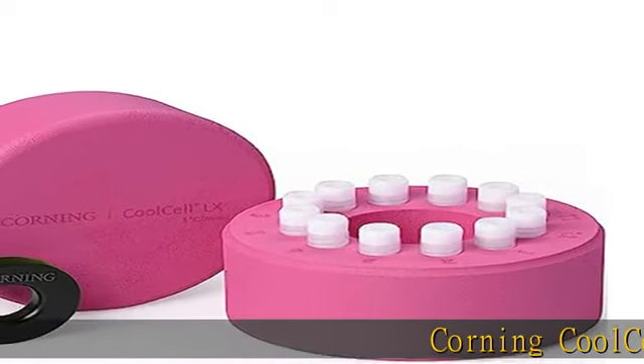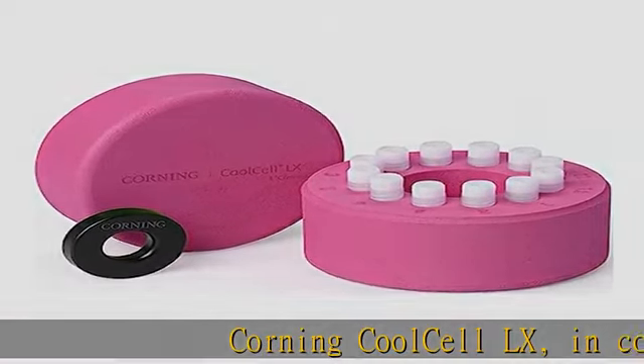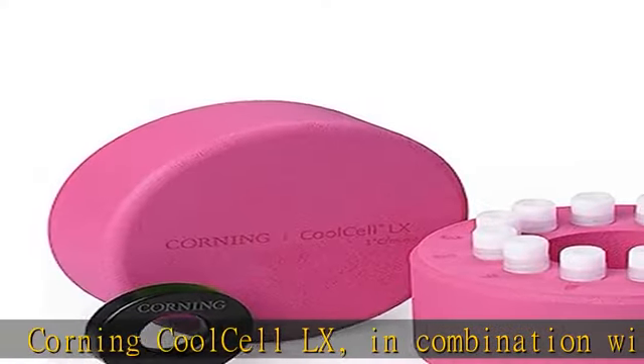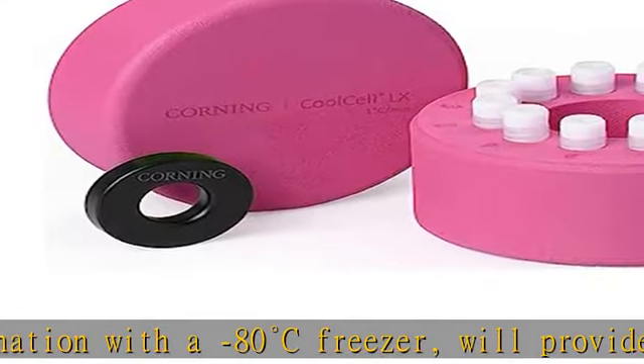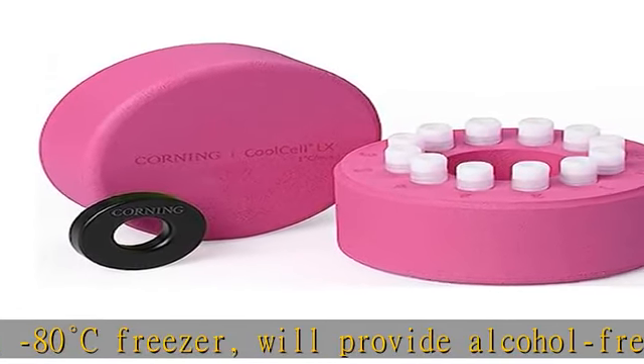The Corning Cool Cell LX, in combination with a minus 80 degrees Celsius freezer, will provide alcohol-free freezing at the rate of -1 degree C per minute that is ideal for cryopreservation of most cells and cell lines.